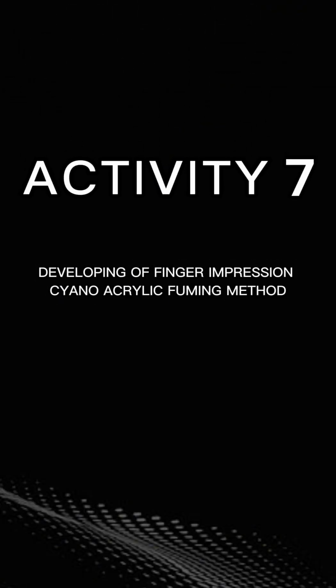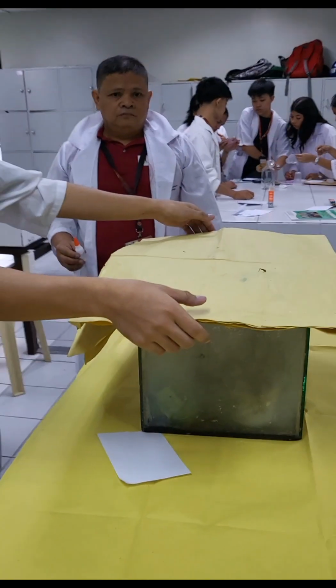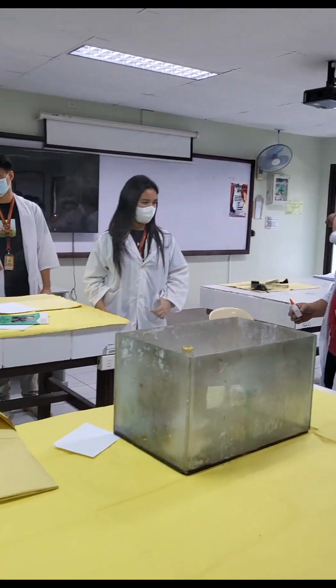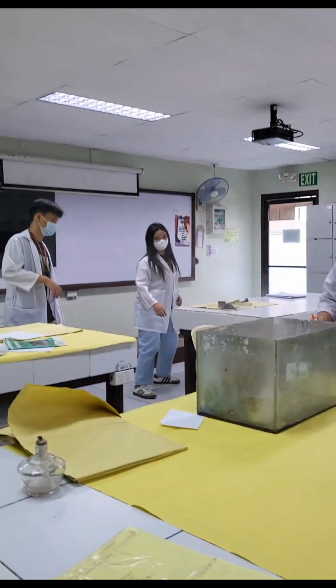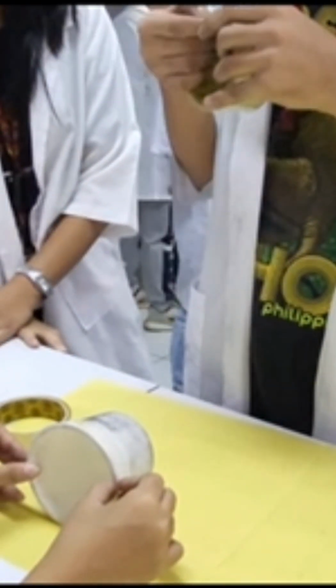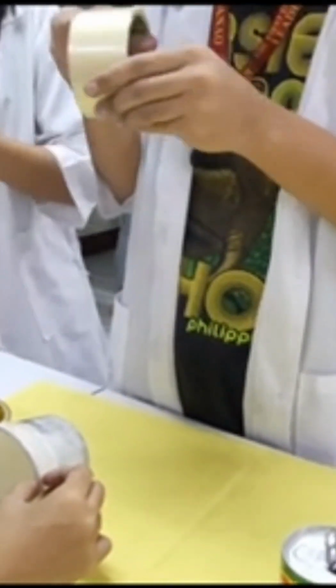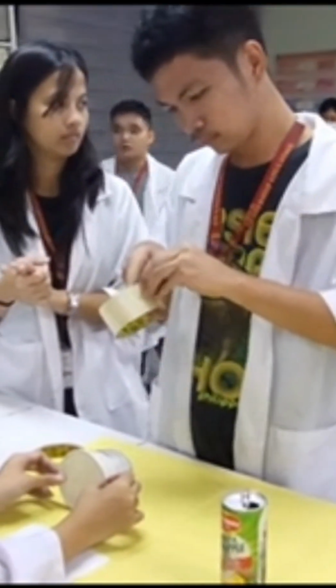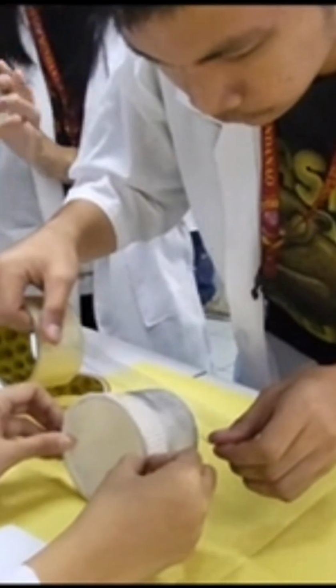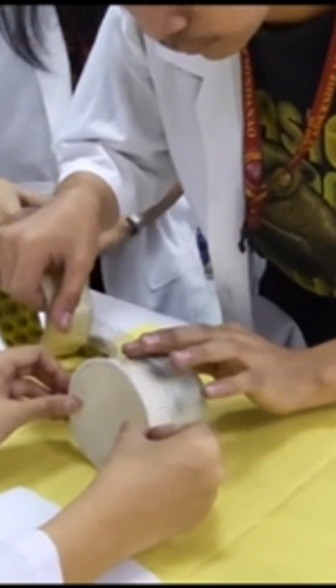Activity 7. Developing of finger impression, cyanoacrylic fuming method. For our 7th lab activity, which is the superglue fuming gas method, our professor let us conduct the lifting of fingerprint from the cup, bottle, and tin can. We put the lifted fingerprint into a 1/4 piece of bond paper. The pictures show our output for the 7th lab activity.